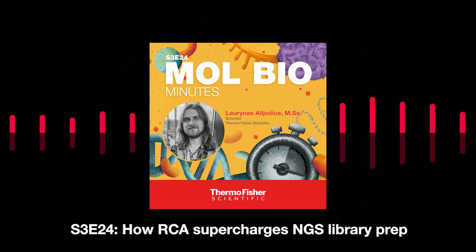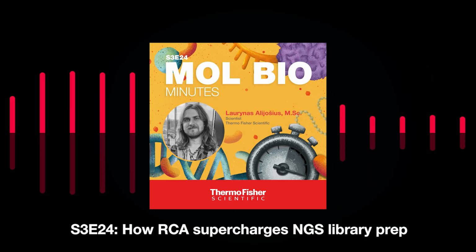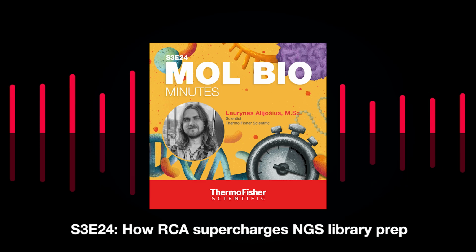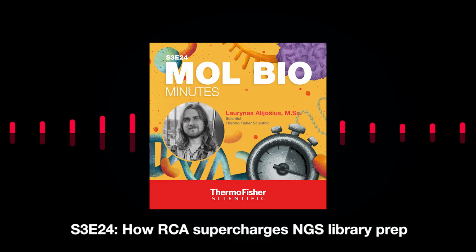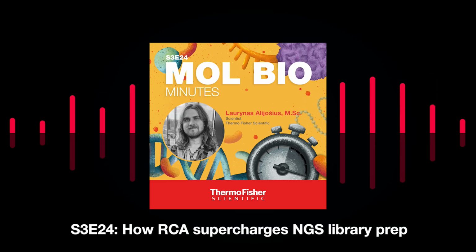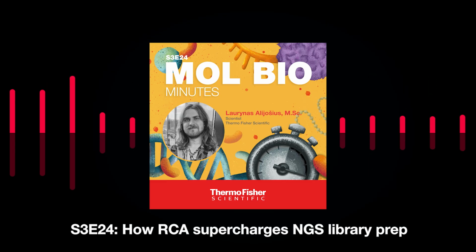On top of that, the RCA method is convenient to combine with next generation sequencing applications because Phi29 polymerase has low GC content bias. Also, it is a high fidelity polymerase, which is improved by the proofreading activity because of its 3' to 5' exonuclease domain.